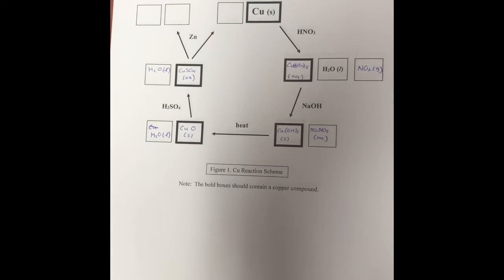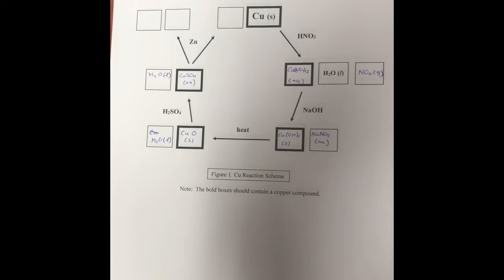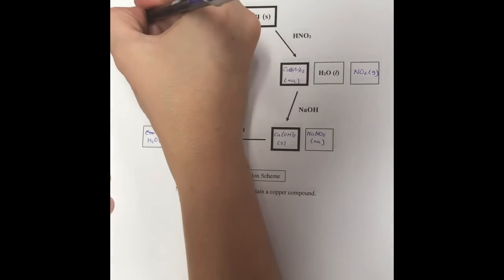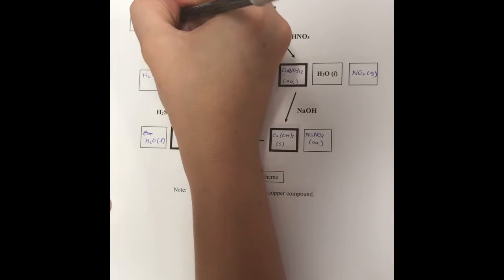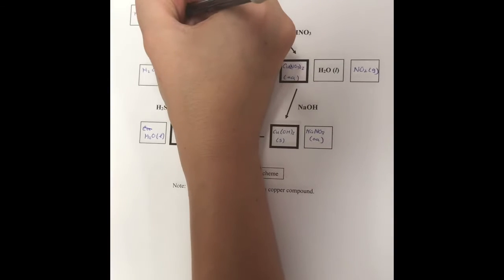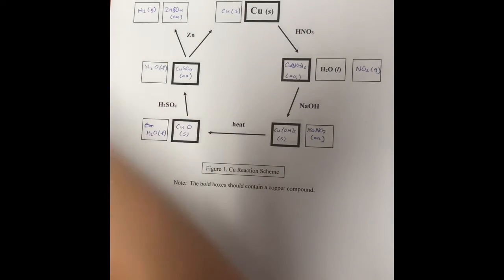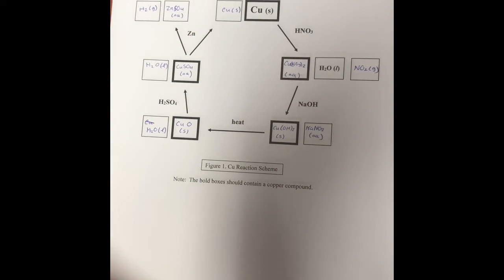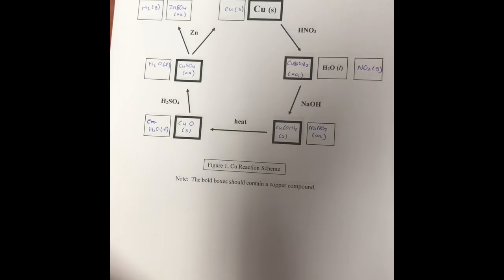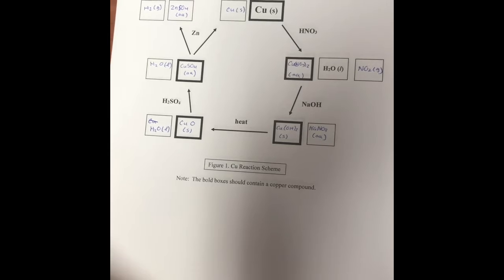Finally, the zinc was added. This reaction produced H2, ZnSO4, and solid copper. The colorless gas given off was our hint for the hydrogen gas, and the colorless solution gave us the clue about the ZnSO4. The last substance we found was the reddish solid, which was the copper.